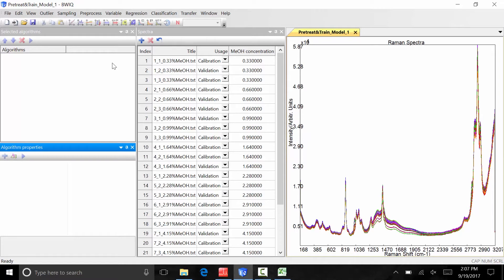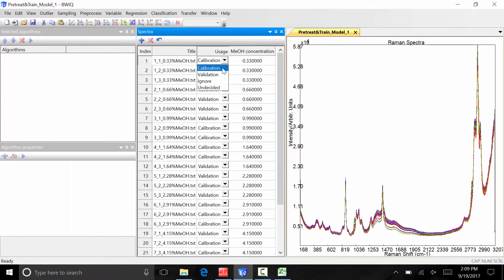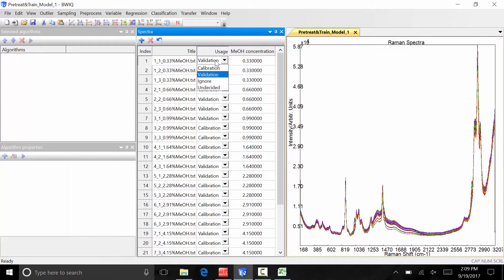Spectra files can also be manually designated as calibration, validation, or ignored files by clicking the drop-down button under the usage column. Files designated ignored will not be included in the final analysis.